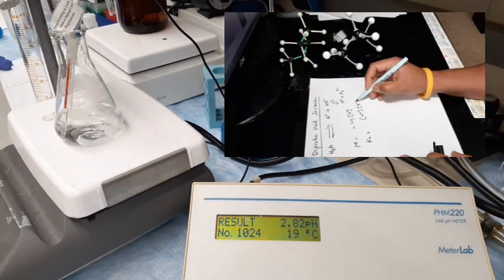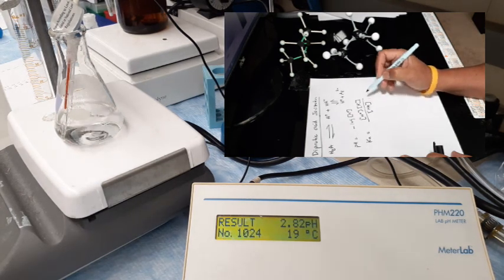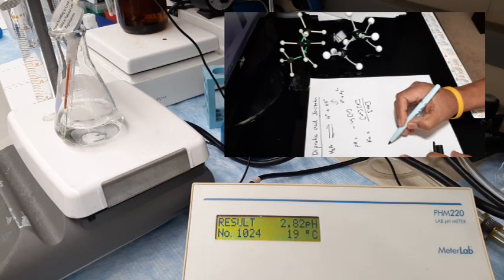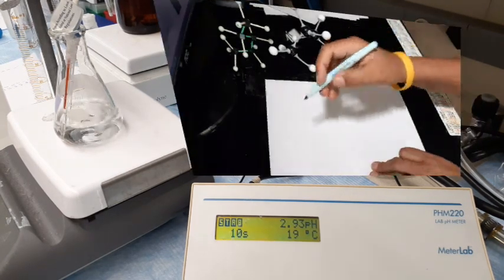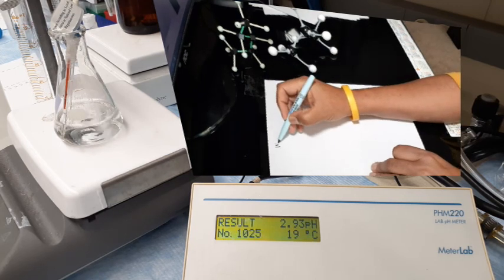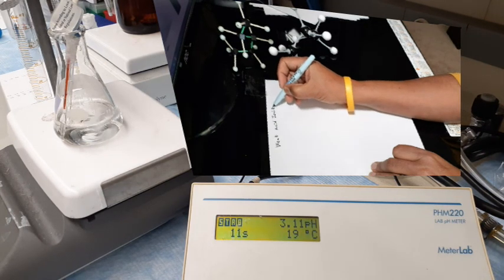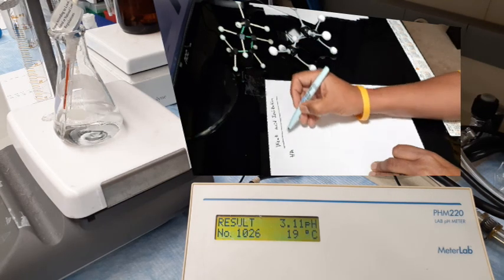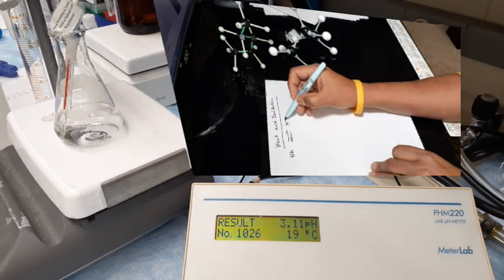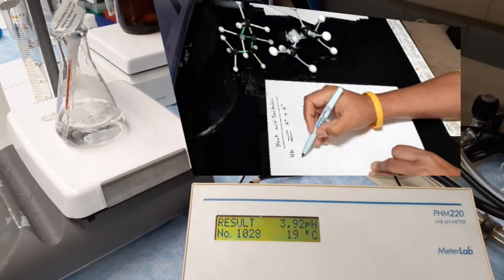At 30 ml we are at 2.82 pH. That's 30 ml of sodium hydroxide added, and the pH is 2.82. I will continue adding. So I added 1 ml more. Now the pH has jumped to 2.93. It looks like it's close to the equivalence point, I believe. This is 3.11. It's the highest change I saw so far. This also looks like a rapid change.